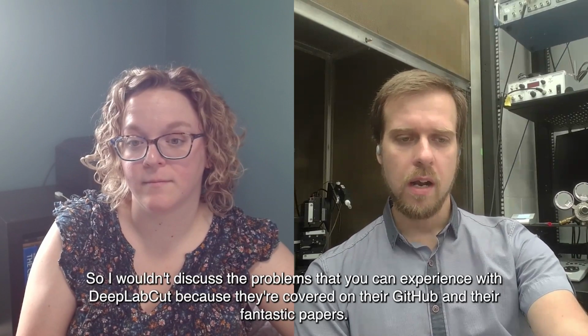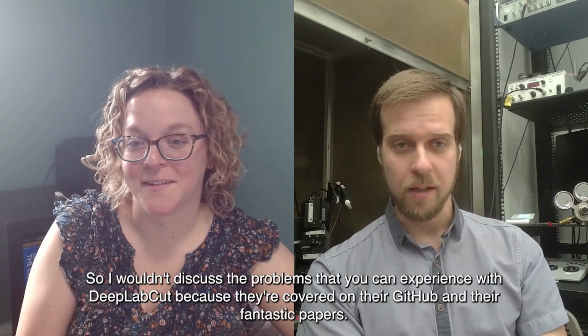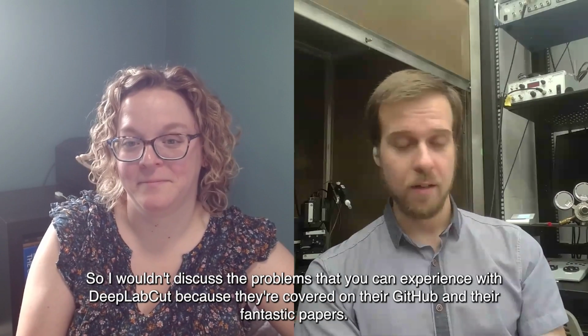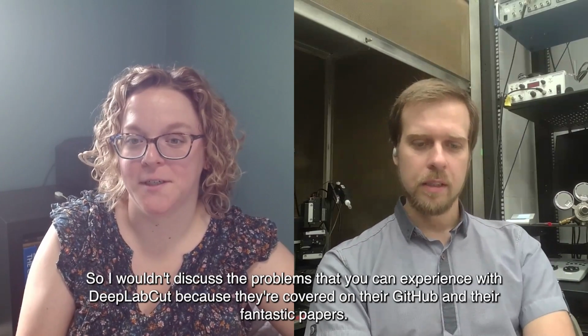I wouldn't discuss the problems you can experience with DeepLabCut, because they're covered on their GitHub and in their fantastic papers.